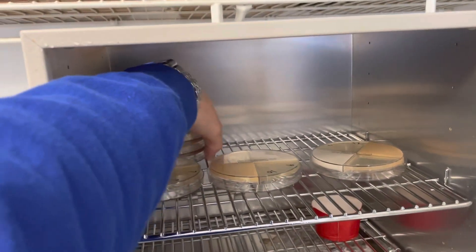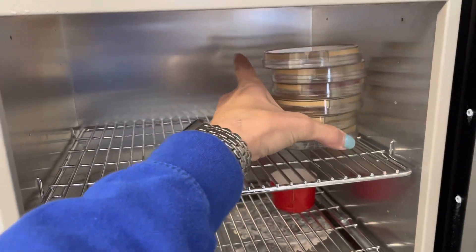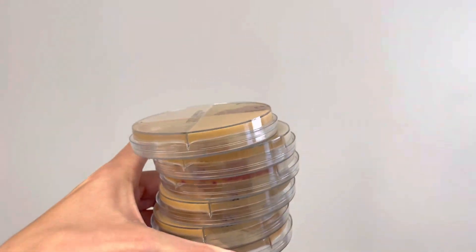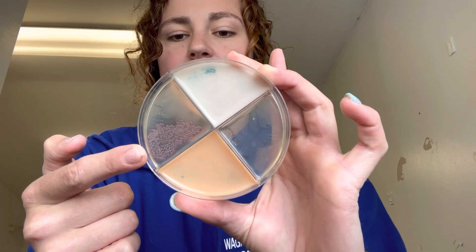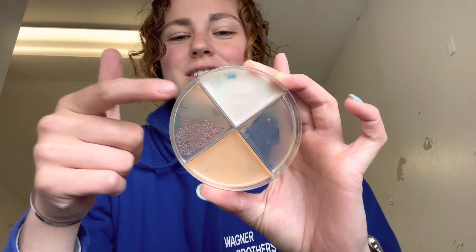It has been 24 hours — actually over that — so we're going to take the samples out of the incubator and see what we got. Okay, so the first one — we have the pink stuff. E. coli. This one's E. coli. This one's no growth. So I'm going to write the results in my notebook.